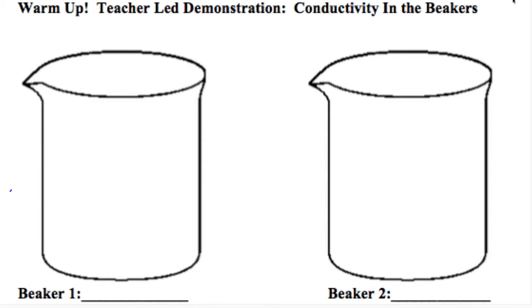Okay, today we're going to do a little conductivity warm-up, taking into account things we learned yesterday with solubility rules and net ionics. So in the first beaker that you have, those of you at home, I'll try to give you visual cues as to what's going on. I'm going to have just water, H2O. So I have this little conductivity tester, which, if there are free-floating ions in solution, it will light up. Here I have DI water.